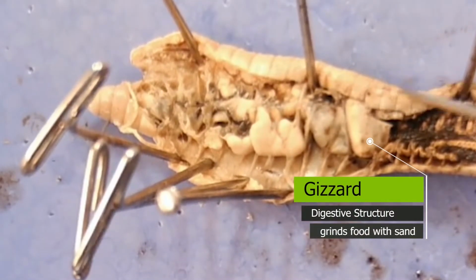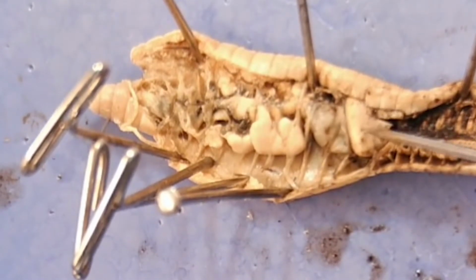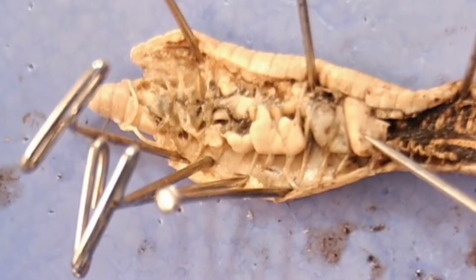All this is intestine. This organ here is very thick-walled. If you touch it, it's really hard to the touch. This is actually the gizzard. Can everybody see right there?